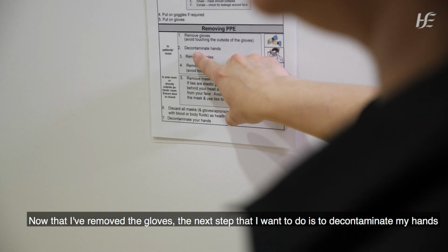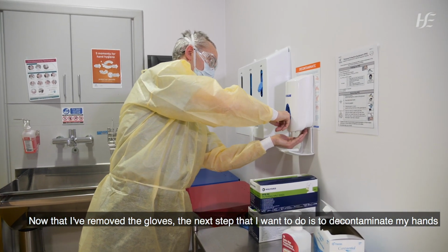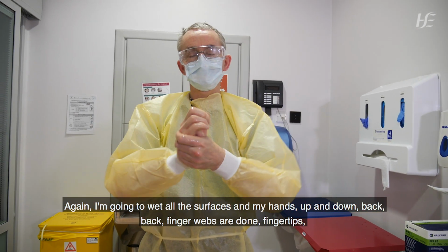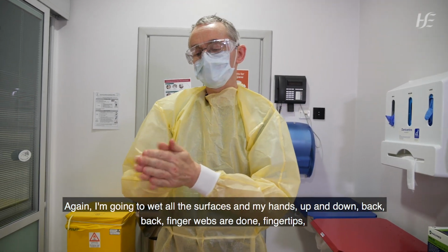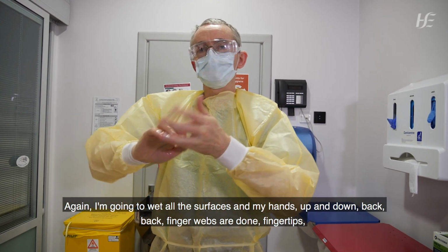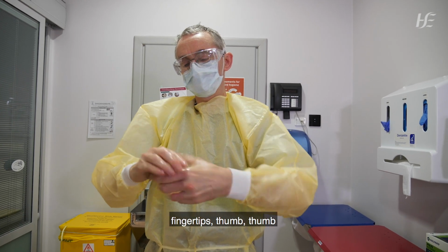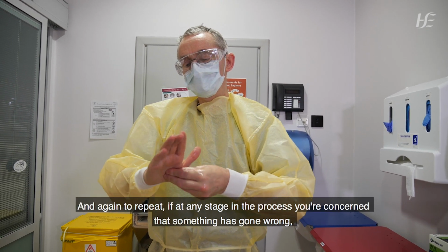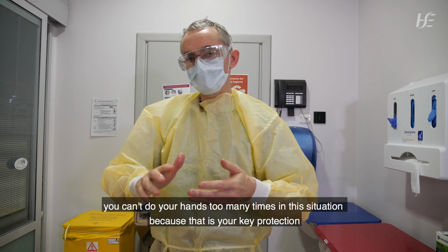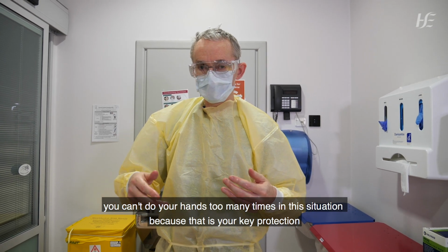Okay, so now that I've removed the gloves, the next step that I want to do is to decontaminate my hands. So again, I'm going to wet all the surfaces of my hands, up and down, back, back, finger webs, fingertips, thumb, thumb. And again, to repeat, if at any stage in the process you're concerned that something has gone wrong, you can decontaminate your hands. You can't do your hands too many times in this situation because that is your key protection.